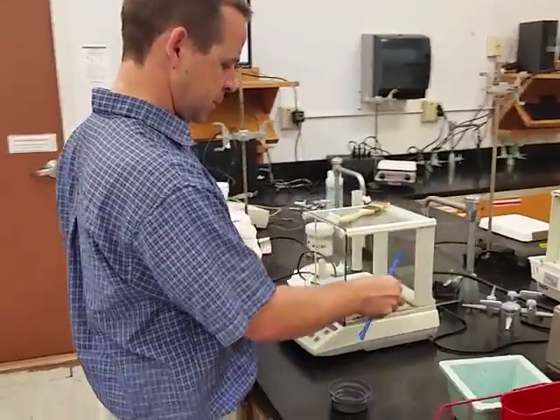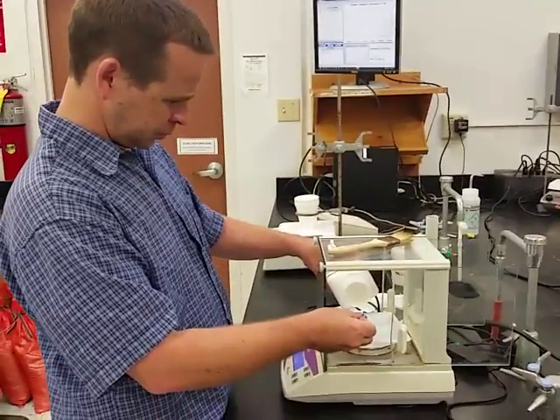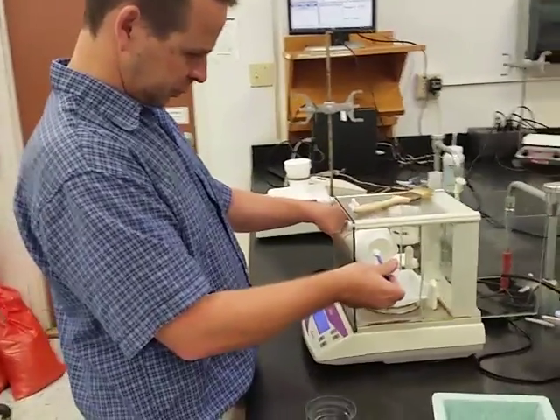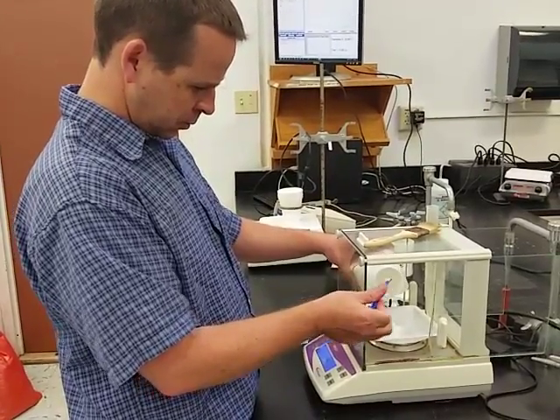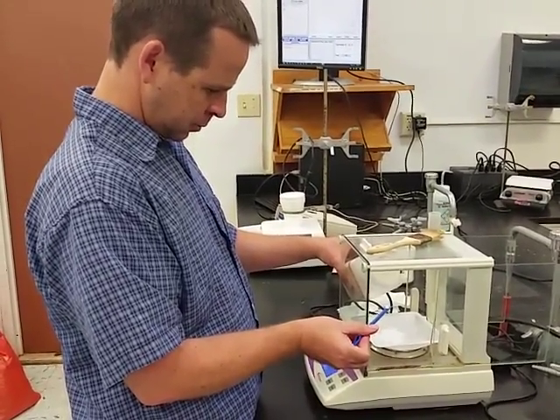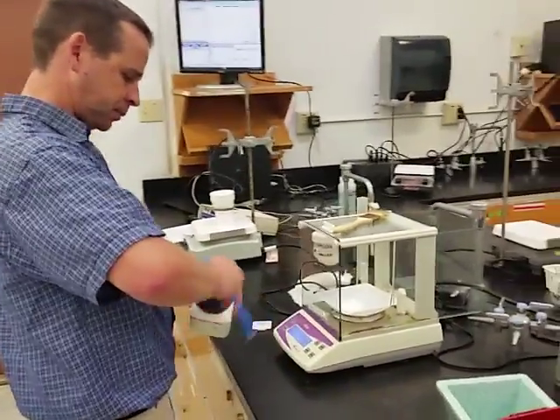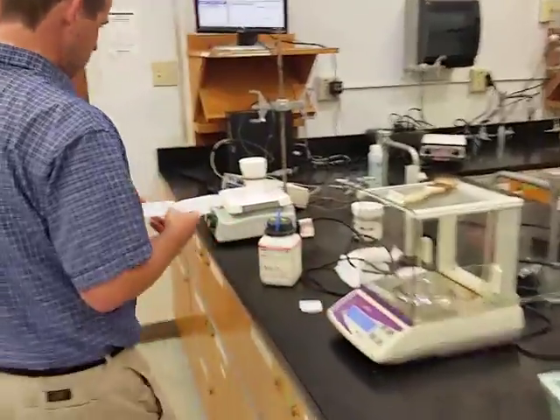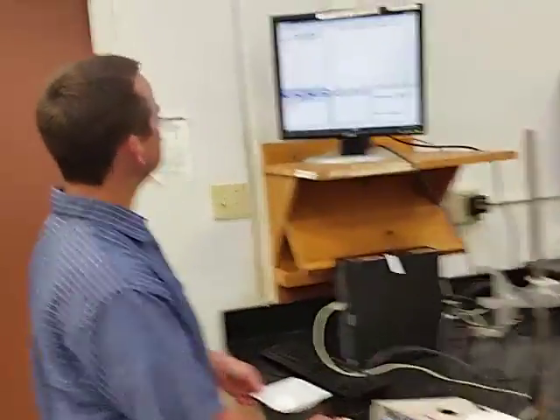Okay, so I'm going to weigh out our 5 grams of magnesium sulfate. 4.7, 4.8. All right. We got it. So we can now, we're ready to add this into there.